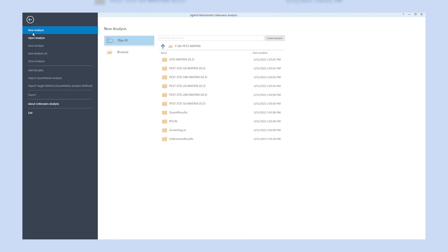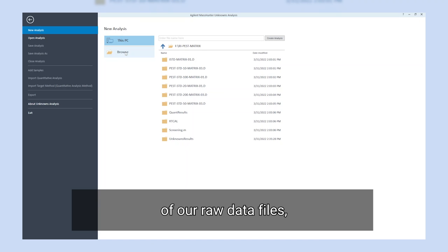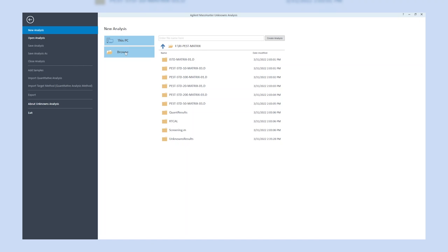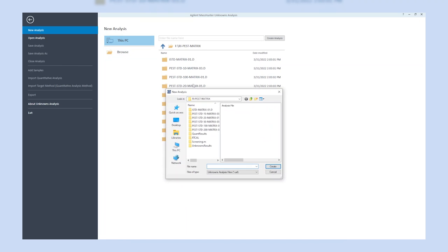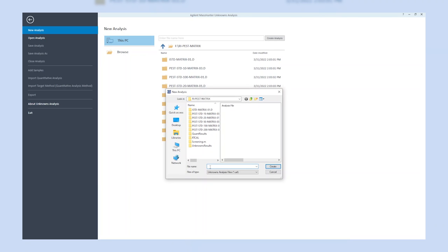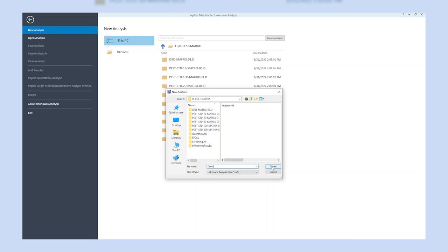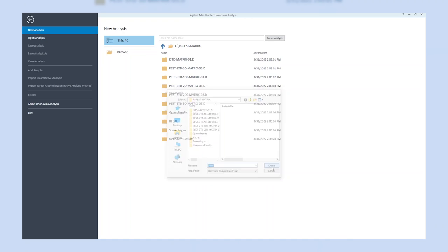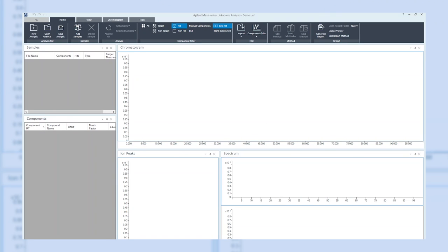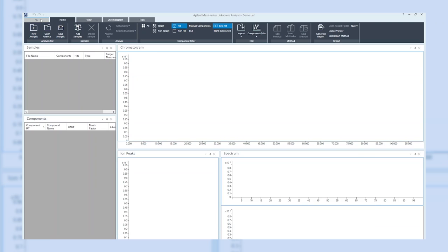Once the program is open, you can create a new analysis by clicking on the icon in the upper left corner. In the next step, we will navigate to the location of our raw data files, enter a name for our new analysis, and finish the process by clicking on create.